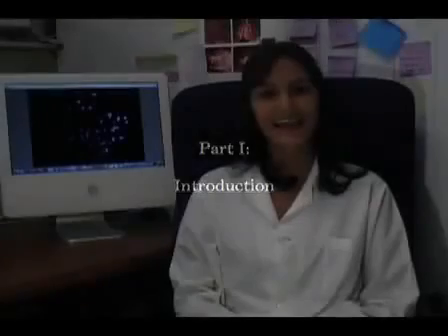Introduction. Hi, we are from the Institute of Biomedical Science at the Federal University of Rio de Janeiro in Brazil. In this video, we'll be preparing chromosome spreads of human embryonic stem cells to detect the possible numerical chromosome alterations.